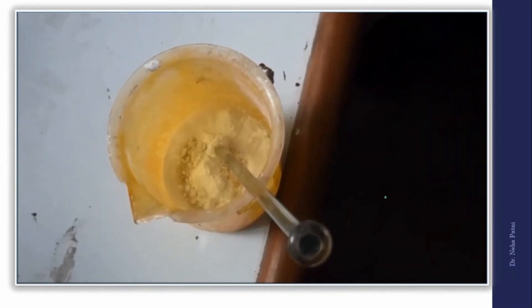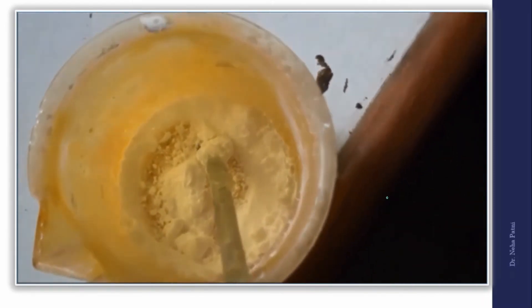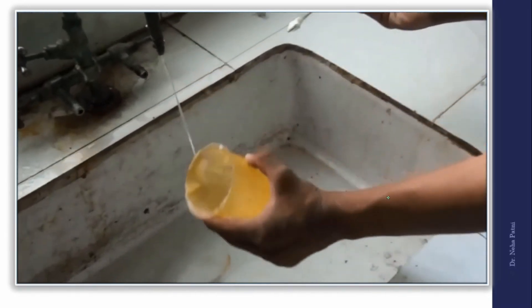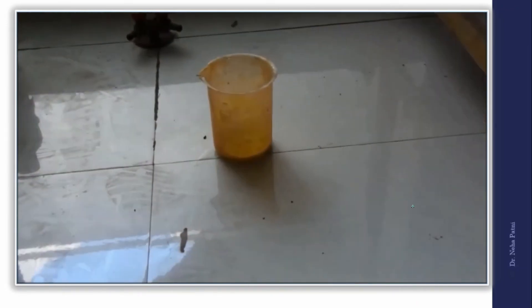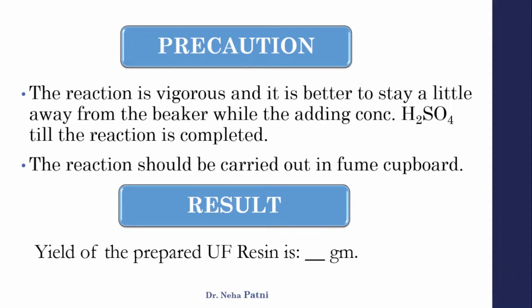Add a few drops of concentrated sulfuric acid and start stirring again. Within a few minutes you will be ready with your solidified UF resin. After it solidifies, wash it with water first because excess acid will be present — do not touch it directly. Weigh the beaker with the resin before discarding. This completes the preparation: formaldehyde, urea, and a few drops of acid give you UF resin.